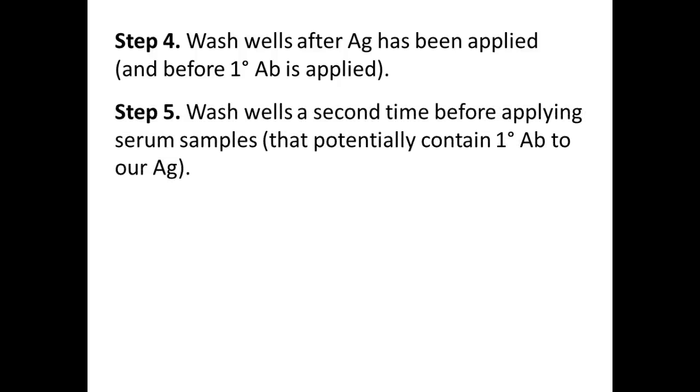And we have to do this before we apply the primary antibody, right? So anything that's not sticking, we want washed out. And we're going to do it twice. We're going to rinse twice. Why do we wash? What did I say? We're making it stick, right? Is everything going to stick? No, right? If it doesn't stick, we don't want it there. We want it to be washed out, okay?